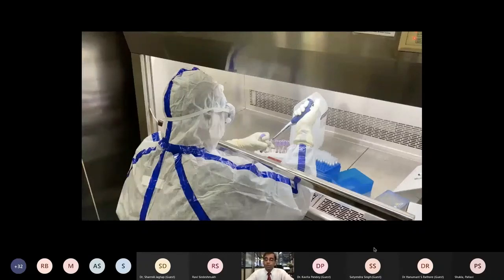You can do the depletion, you can perform the discovery experiment nicely, and you have already taken care of all the pre-analytical variables, which I spoke about in my previous lecture, and made sure that everything has been stored immediately, and you process all the samples in a week's time. So you have done everything in a meticulous way. Now even these 40 samples, if you do depletion, will give you a very reproducible result.